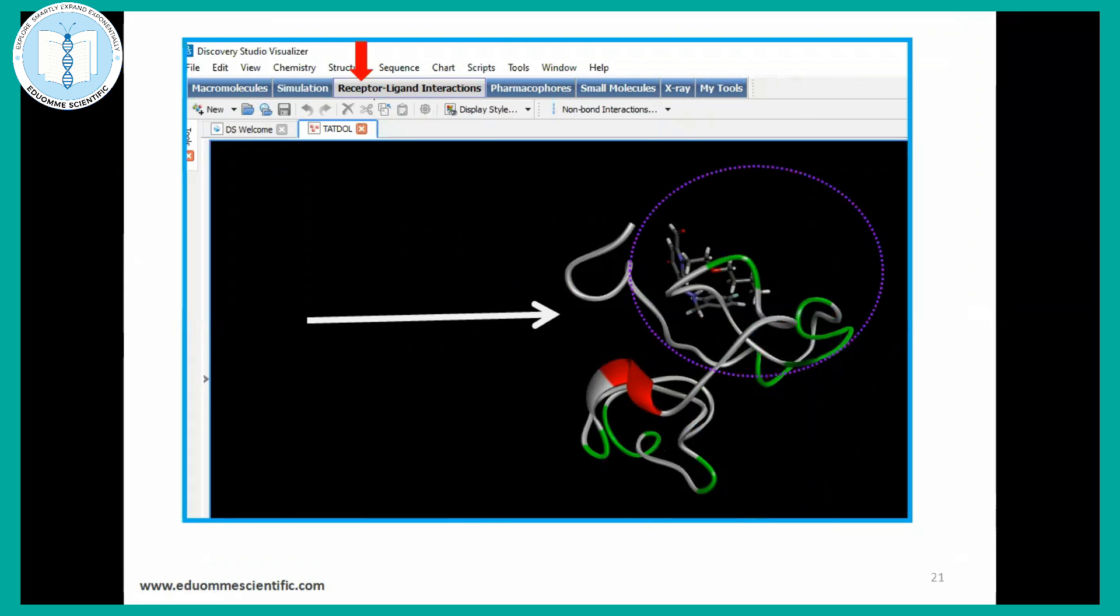If suppose you are doing receptor ligand analysis, docking and those kind of things, this is one of our docked data from our one of studies. If I'm not wrong, it is HIV-related ligand interaction for therapeutic purpose and drug designing in silico drug designing purpose. This, if I'm not wrong, this is HIV-TAT protein with dolutegravir. You can see how this protein is interacting with this dolutegravir here.